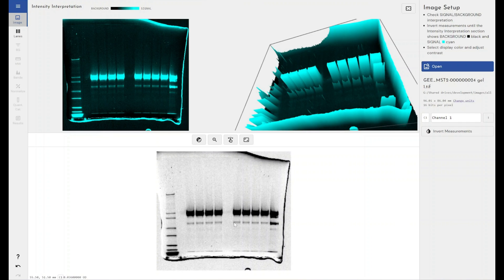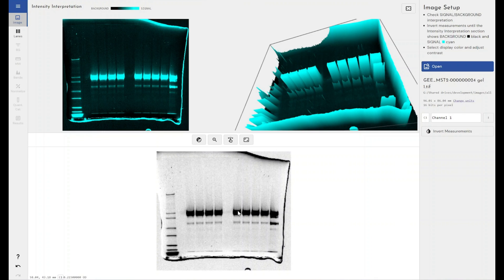The RF value is simply a function of how far has my protein, DNA, or RNA moved as a function of how far it could have moved.